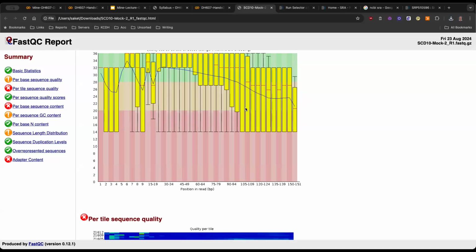Pooja? I'm just looking at one read, just the forward read. So think of it from a technology point of view. Okay, and why? Why is that?